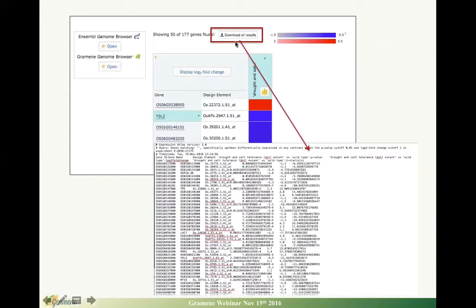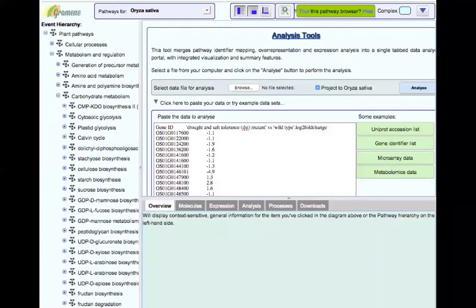So once you have downloaded this particular data in a text format, then you can basically have two columns. One can be the gene ID, and then the second can be your ratio. This has a lot of other information. You don't need that. So what you could do is rearrange the gene ID, and then have the expression values next to it that you want to visualize. So you can reformat your text file here.